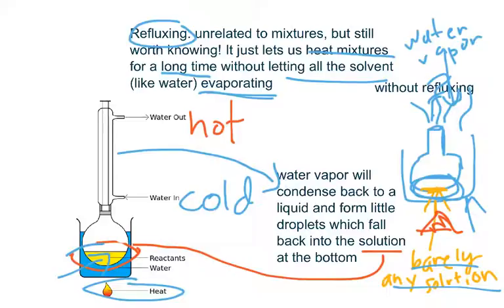So what we do is you use a refluxing tube. Now, a refluxing tube, as you might notice, is very similar to a condenser in a distillation apparatus or device, because water goes in and it goes out here, and it's usually cold water. So basically this glass layer thing will condense any water vapor that tries to get out. So maybe these water particles might want to get out through the top. But this refluxer will make sure to minimize that effect.